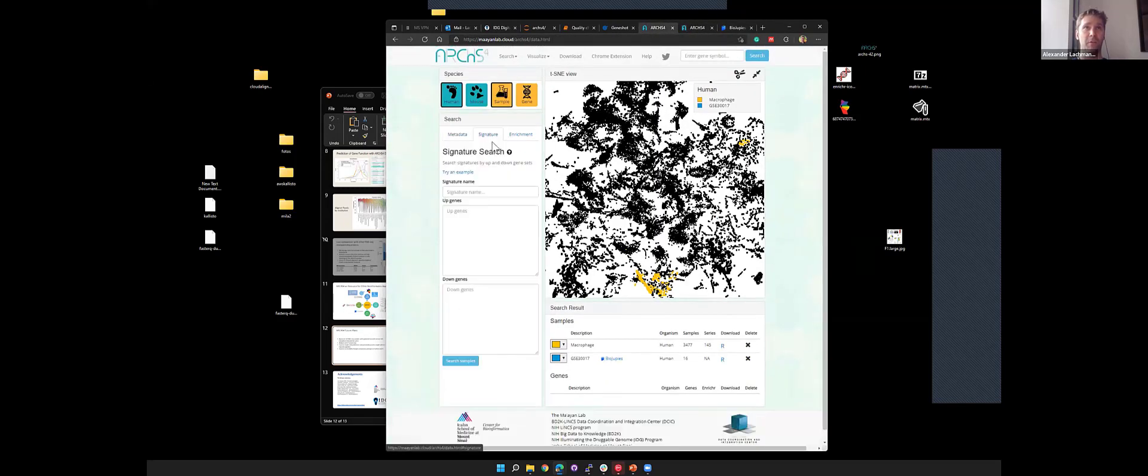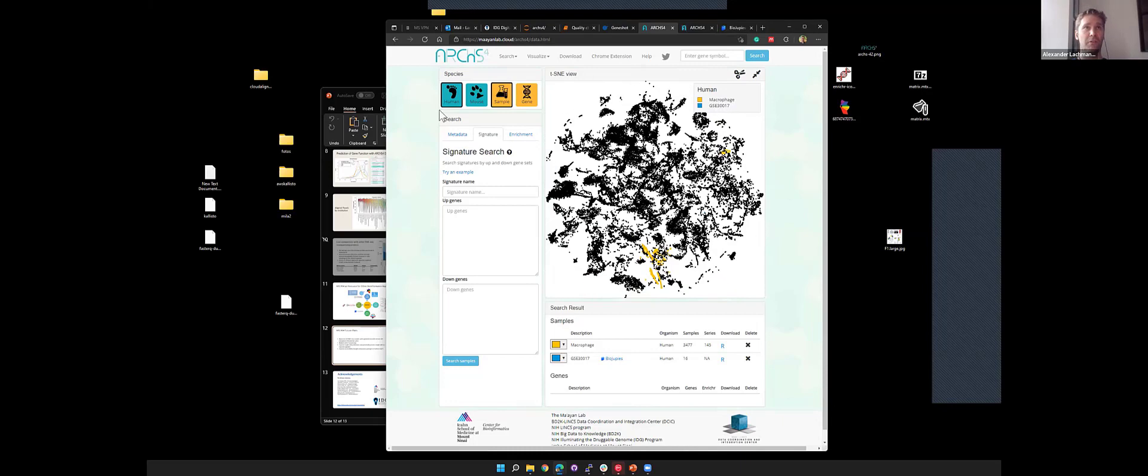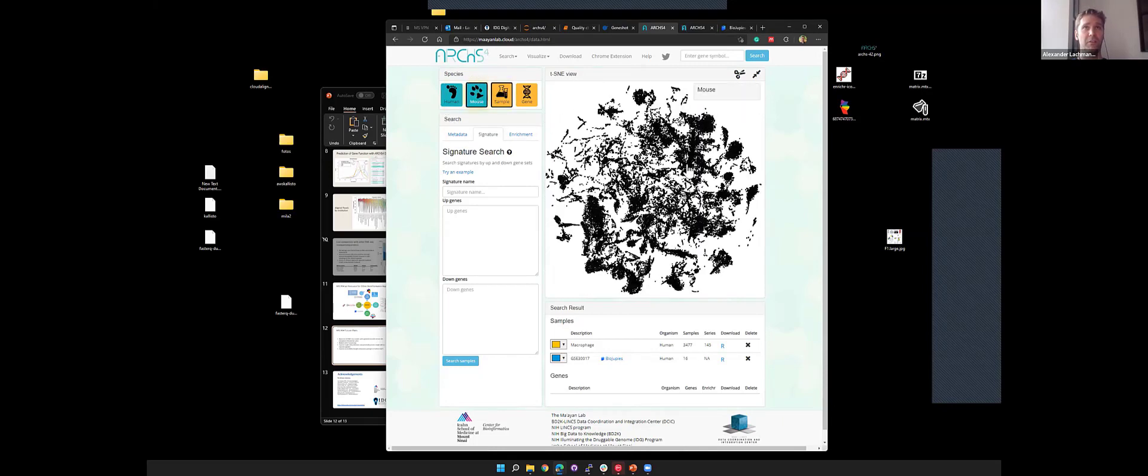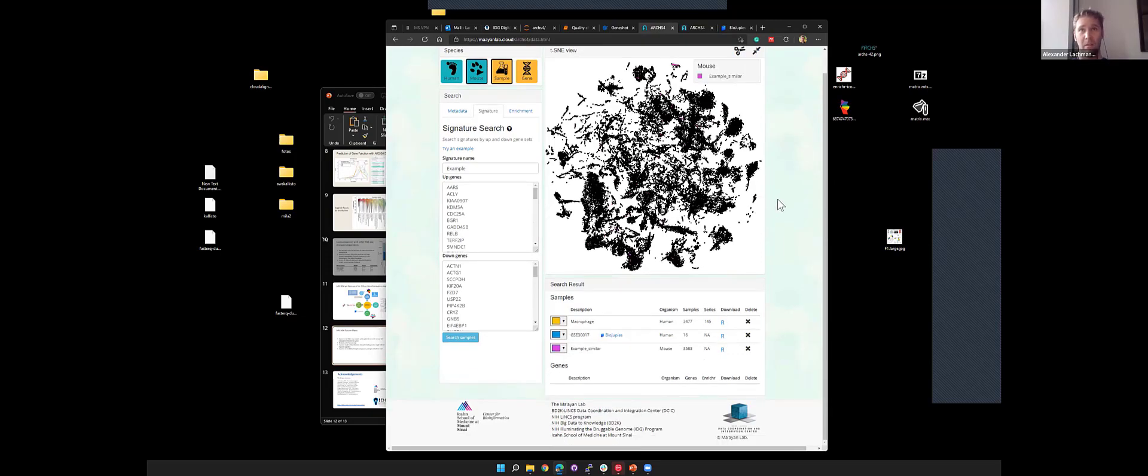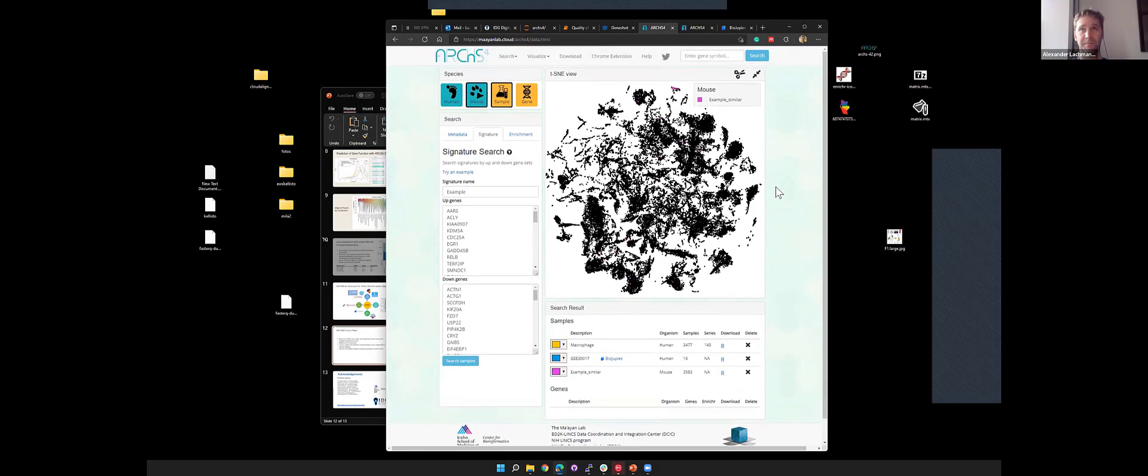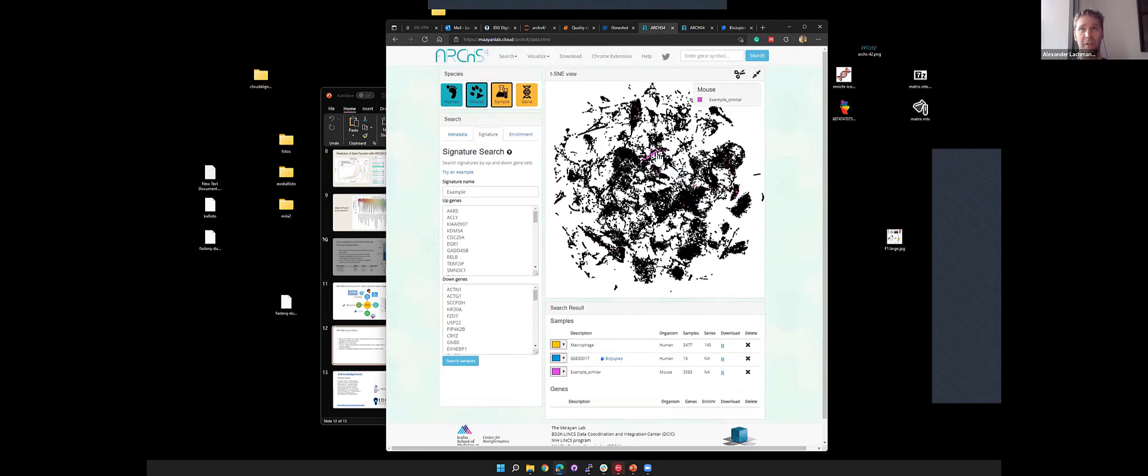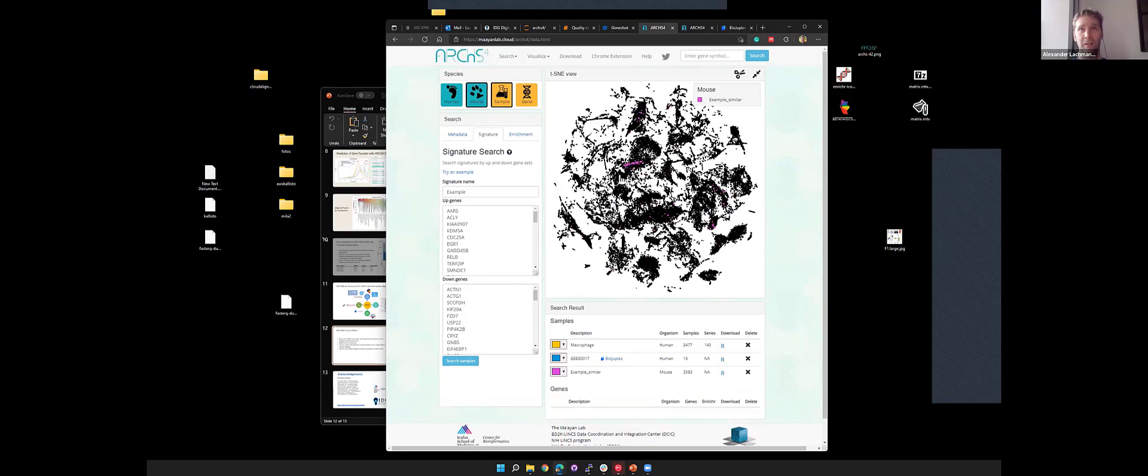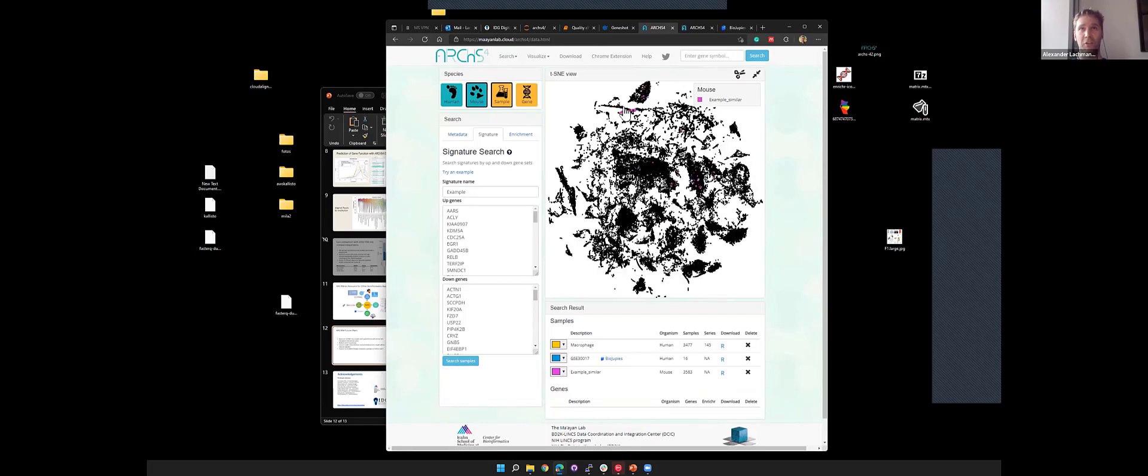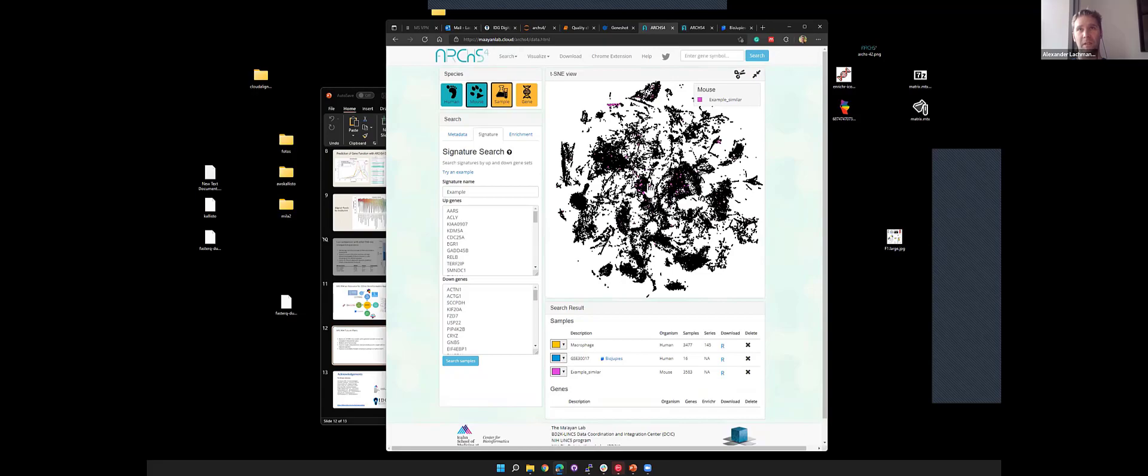Another brief thing to do is I can also search for signatures. If I go to the mouse data and try to search signatures that match these up and down regulated genes, this is what I get. I find this cluster here. These samples seem to match this input query, but there's some scattering all around.